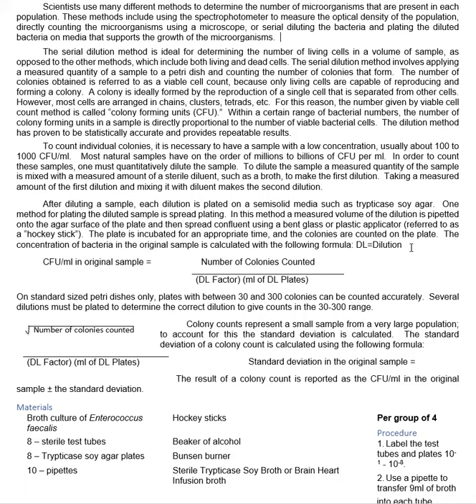I do the same thing all the way through until I get, I can't remember, 10 to the minus 6 or so. We'll have to actually look at this. No, we have eight test tubes, 10 to the minus 8. Although really, to be honest with you, by then you really don't get any bacteria. But in any case, that's basically the technique that we use.